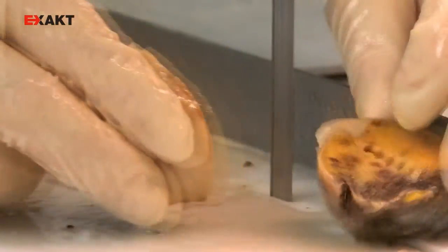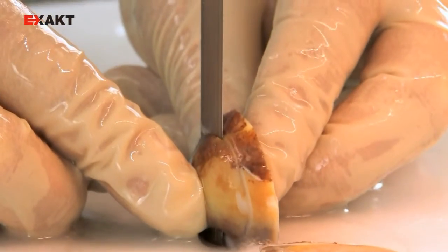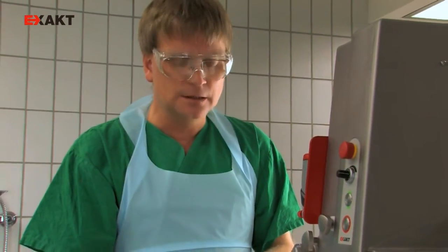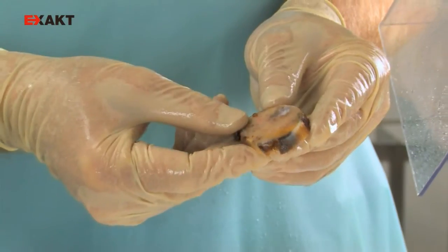Another advantage of the saw is that the cuttings can be cooled during operation. You can now see beautifully executed edges that are absolutely smooth without a trace of artifact.